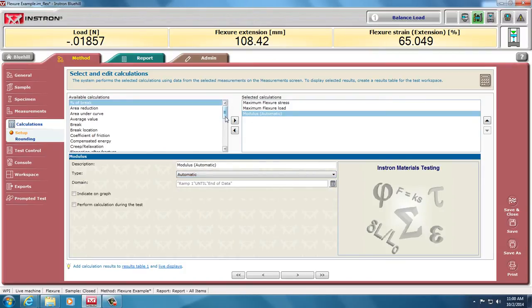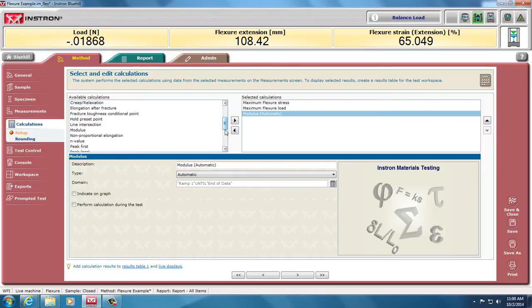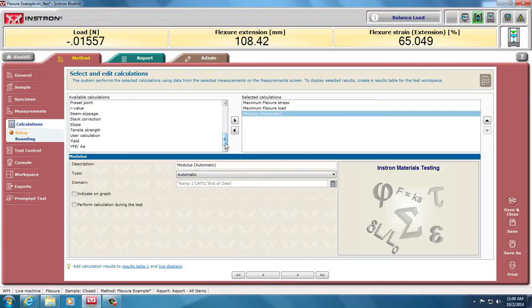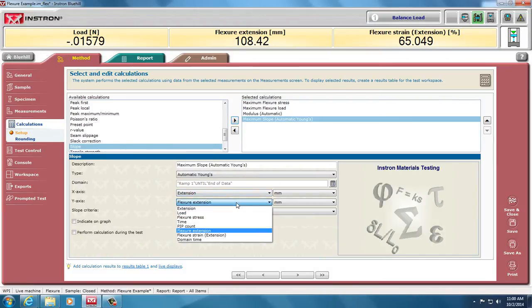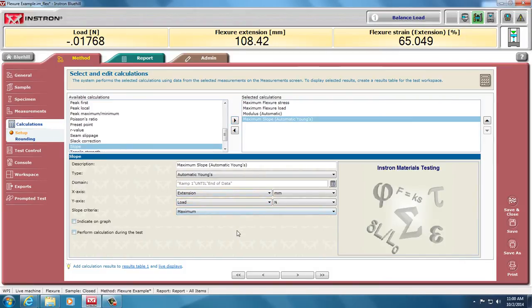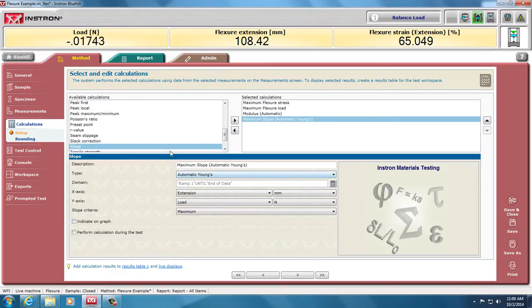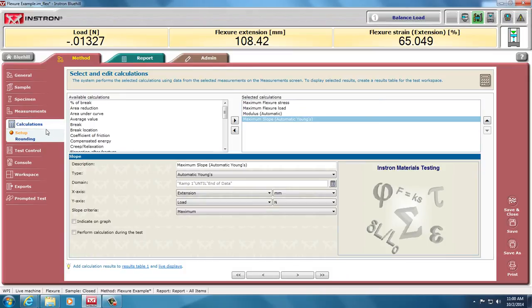For my calculations, when I have something like a bone, I want to know the force-displacement relationship. So I want the slope and I want it between extension and load. And then I can use that in my calculations for the modulus of the material and do it on my own when I put my own calculations for the moment of inertia. Again, for a bone that's hollow. We could set up rounding and others, but I'm not going to do that right now.